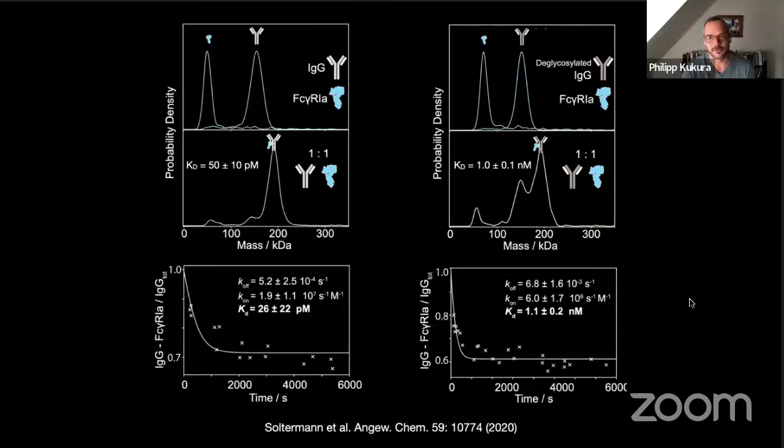Exactly. There's a lot of problems. You add a lot of urea, now you change the refractive index of the solution, so you change the reflectivity of the interface, so then you change the contrast. You know, does the urea bind to the protein? If it binds to the protein, does it change the mass of the protein? How much signal does urea produce when bound to it? You see, it just becomes a mess. But your technique can address this age-old question, whether urea binds to the protein. That's really, and now because you're streaming on YouTube, I can't say anymore.